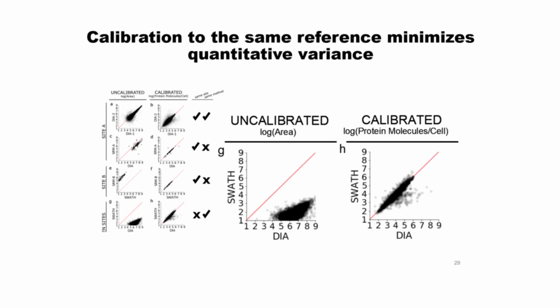Excuse me, if you have human biopsy samples, how would you deal with reference? Do you think that we should do a data bank of reference system for different cancer cells and primary cells? One of the first things that our lab often discusses when we take on a new project is what that common reference will be. Let's start allocating enough of that reference away so that when someone comes back to us in 5 years' time, we can make measurements relative to that same reference.